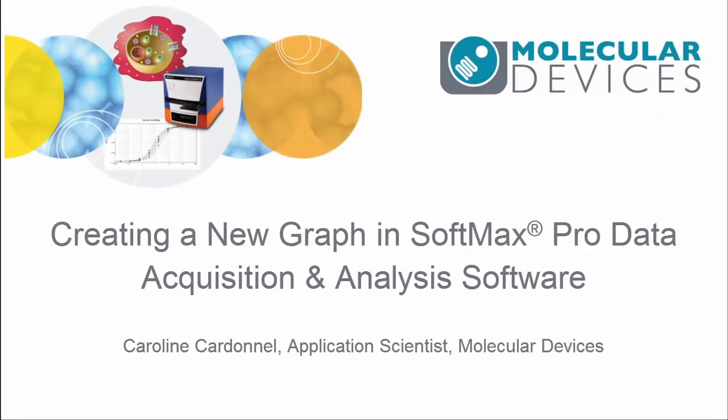Hello, my name is Caroline Cardenel. I am an Application Scientist for Molecular Devices. And in today's video, we're going to have a look on how to add a new graph section to an existing protocol.